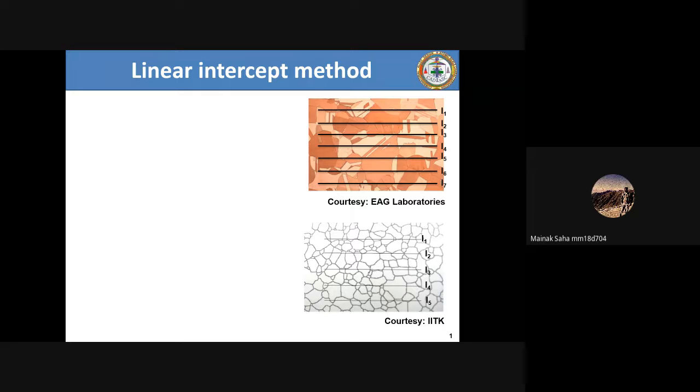So today, there are a number of methods. Now let me ask you, how many methods are you aware of? How many methods did Sir tell you? I'm not sure of the number actually. Which methods do you know? The linear intercept method is very common. Then the other one? Any idea? Okay, fine. I'll start today.